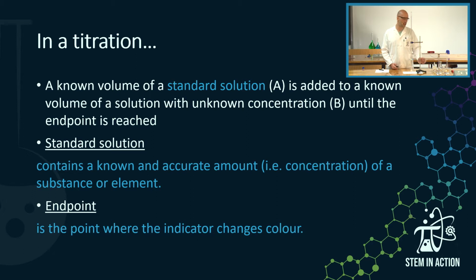I accurately measured it on a balance, so I know exactly how much sodium hydroxide I added to a known volume of liquid. And so I know exactly what that concentration is. The endpoint is where you will observe a color change from the indicator.